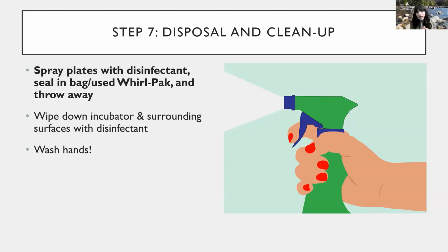But the plates themselves, keep in mind, they are growing live bacteria colonies. So these need to be sealed either in a Ziploc bag or in a used Whirl-Pak. Spray it with disinfectant first, seal it up, and then you can throw it away. You also want to make sure to disinfect your incubator, all the surrounding surfaces that you use, and most importantly, wash your hands. Even if you did use gloves, please wash your hands.